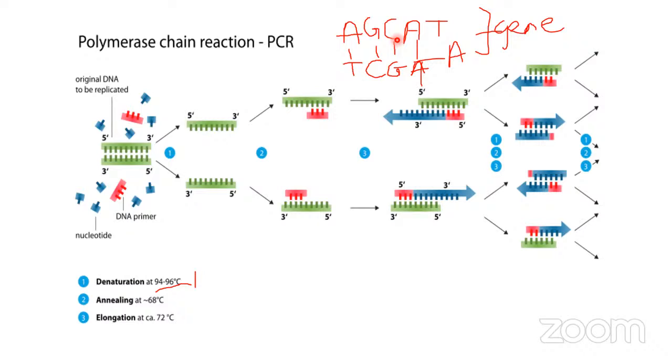So now in a chemical reaction, this is just like a DNA that has a complete, normal sequence. This is what it's supposed to be naturally. So when I now want to do a PCR, what I'm going to do is denature this DNA. When I denature it, I will get a commercial kit or a commercial primer that has the complementary sequence to bind with it, not my original DNA. So let's see what happened here. Now this is what you call the nucleotides. This AGCAT is the nucleotides, and you can get them single to join together. So I can actually join an A with a T, G with a C. Do you understand?